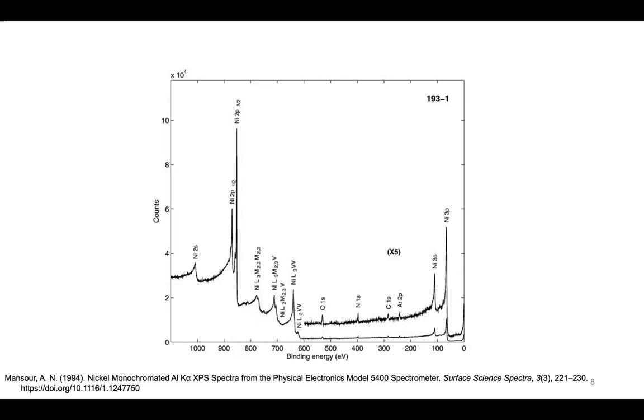And so what you see is the higher binding energies are the core states. So there's 2s, the 2p, the L3M. So this is an Auger peak. That means you've excited an electron, it goes up, and then one electron from the M level will be kicked out, and then another electron will go into the vacuum. So it's a more complex process, but essentially it gets ejected from this L3 to begin with. Okay, and then there are some other species that you see here.